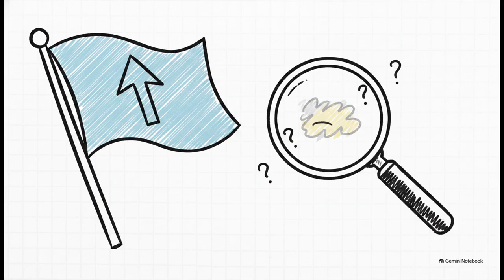And this is exactly why you need to pay close attention to data qualifiers. Some labs will give you a number, but they'll flag it with a letter, often a J-type qualifier. What this means is that the lab detected something, but the concentration is so dangerously close to the detection limit that they just can't be 100% confident in the exact number. It's an estimated concentration. If you're doing compliance checks, environmental assessments, or process troubleshooting, knowing that your number is a lower confidence estimate is literally just as crucial as the number itself.